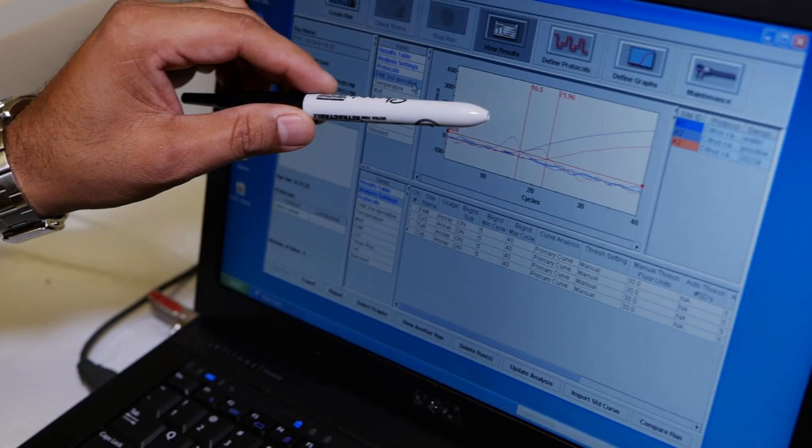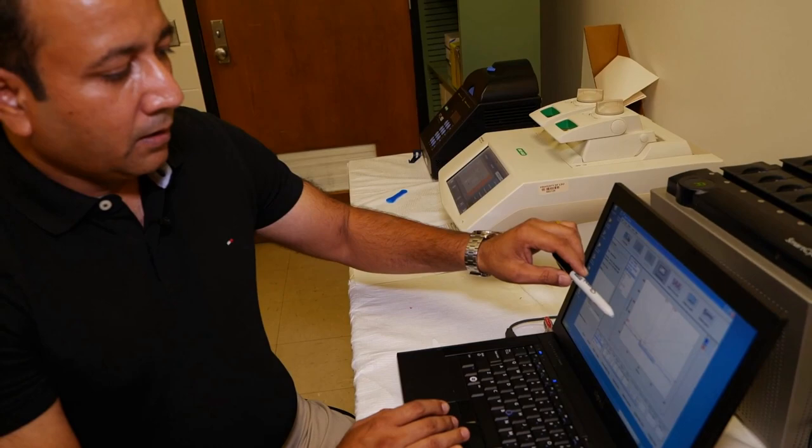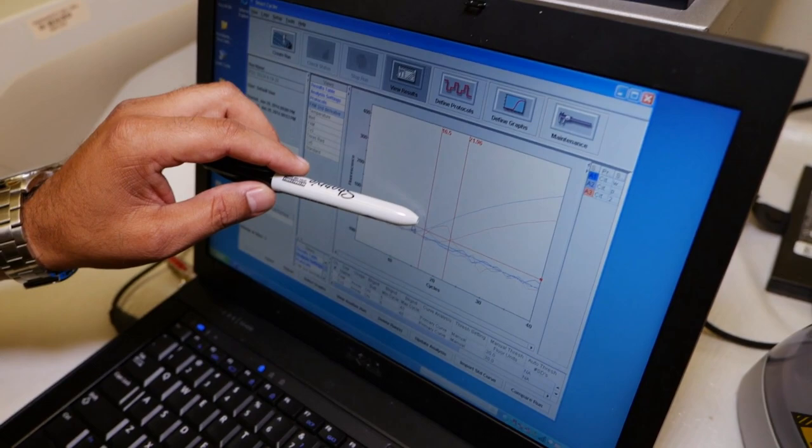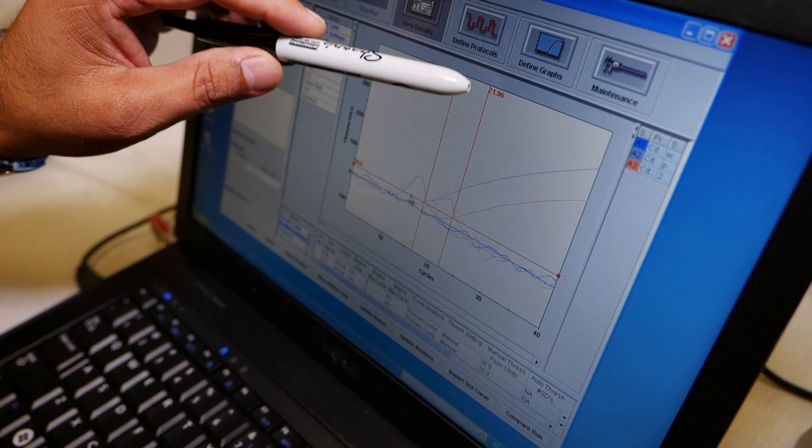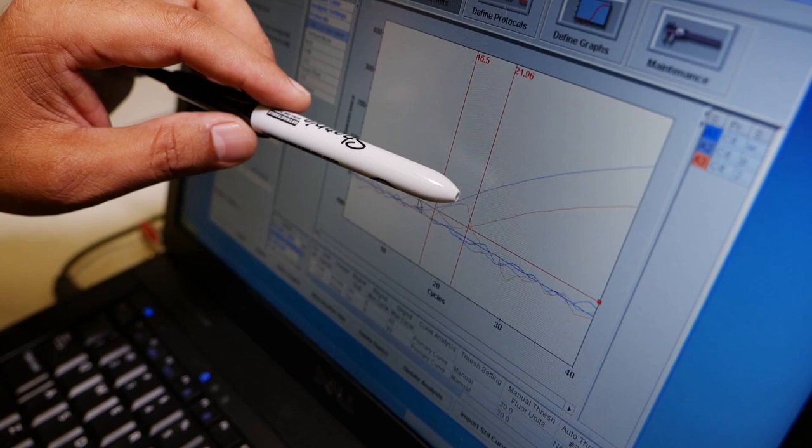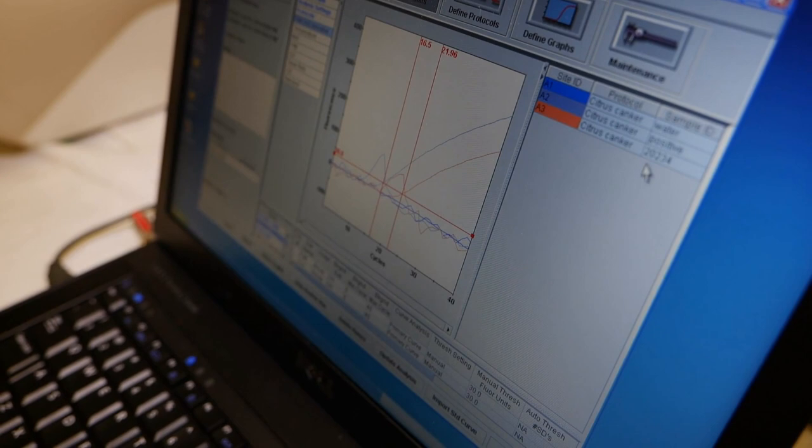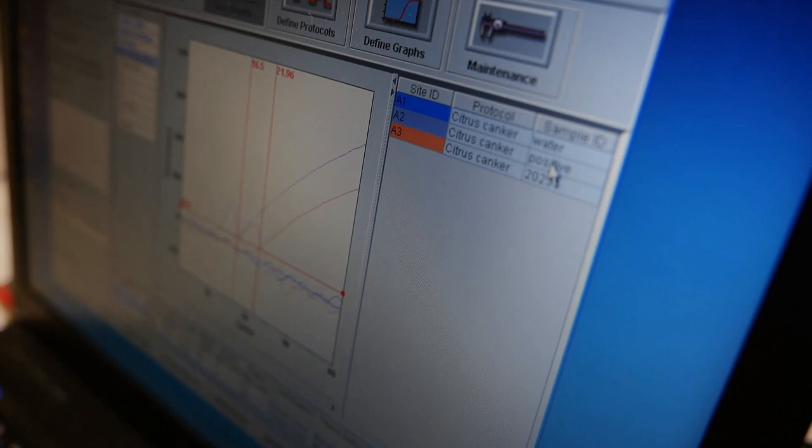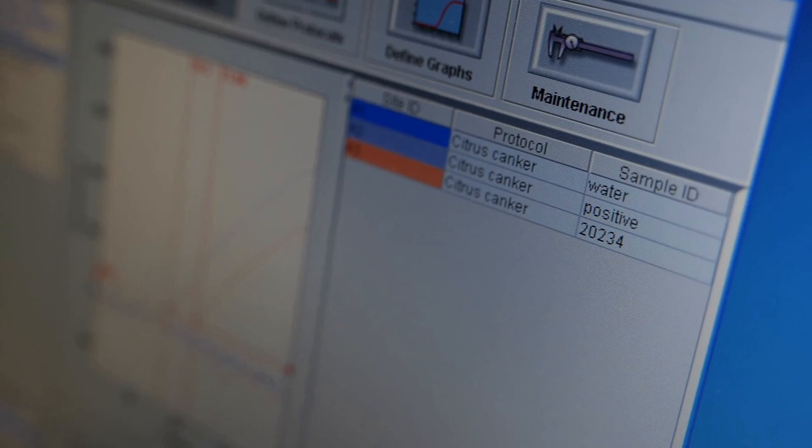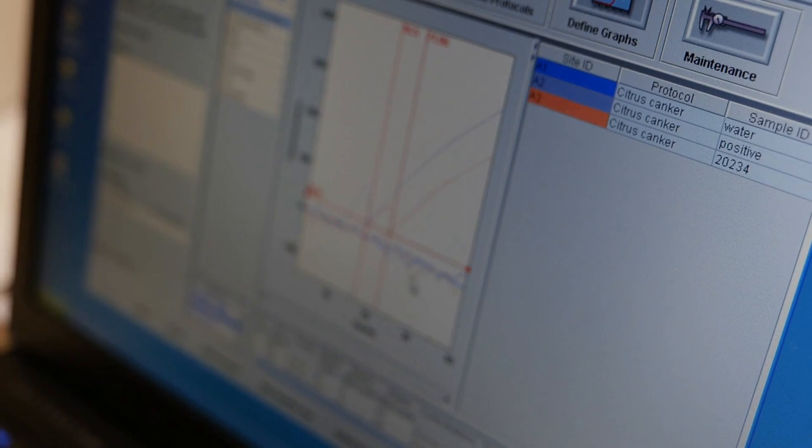This is an example of one of the citrus canker samples that we have here. You see here three lines. What you are seeing here is two samples - one is our positive, which is this blue line, and the other one is our sample. You can see it amplified after 21 cycles. That is a positive, that is considered a positive sample. Here you can see the results - you have the water which is our negative control, the positive which is another control.